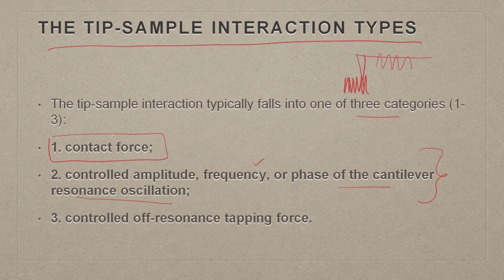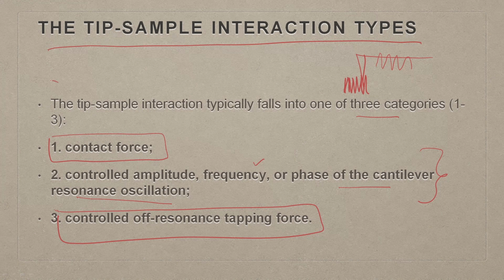Similarly, the third mode is the controlled off resonance tapping force. Here what you are doing is introducing a tapping force and you are seeing the change in that force while your tip is moving across the surface. So these are the basic 3 fundamentals.